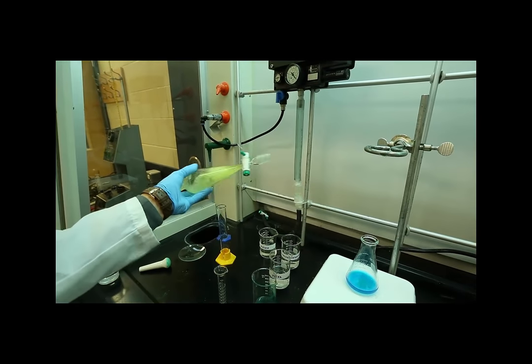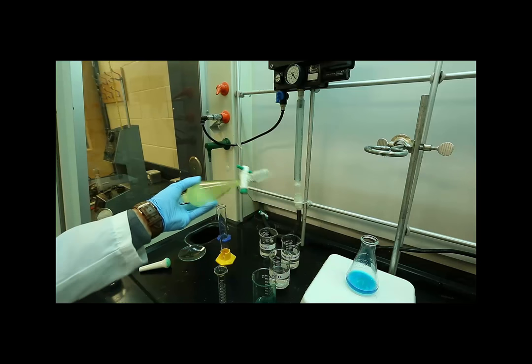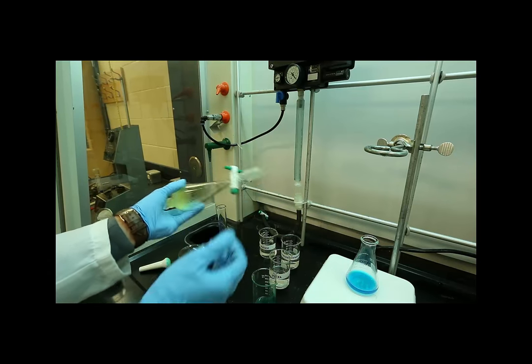It is important to note that you should never throw away either of the layers until you are certain that you have successfully isolated the appropriate compound.